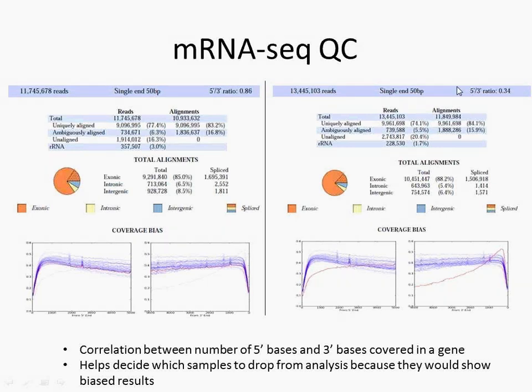And we have developed this 5' to 3' ratio that we have empirically determined to be above 0.7 in order to have some data that you can be confident about utilizing. If you have degraded samples and there's no other choice, you could compare samples that have a low 5' to 3' ratio, but I would recommend that they all align along the same lines in terms of how much of the 5' is connected to the 3', to avoid biases.